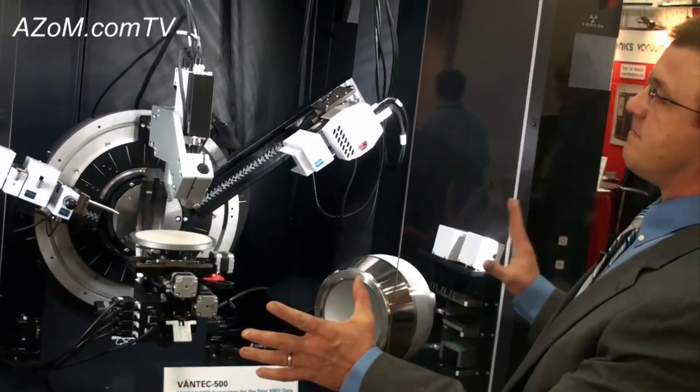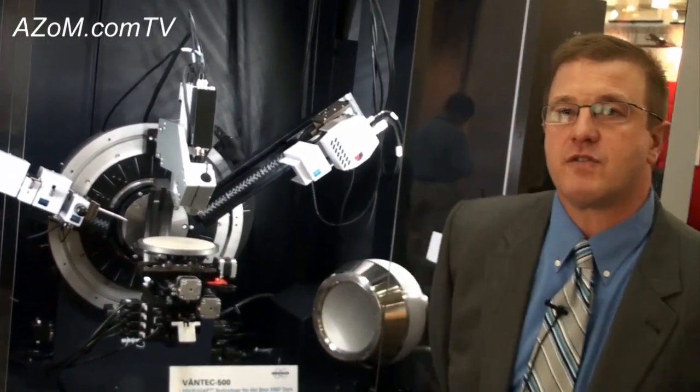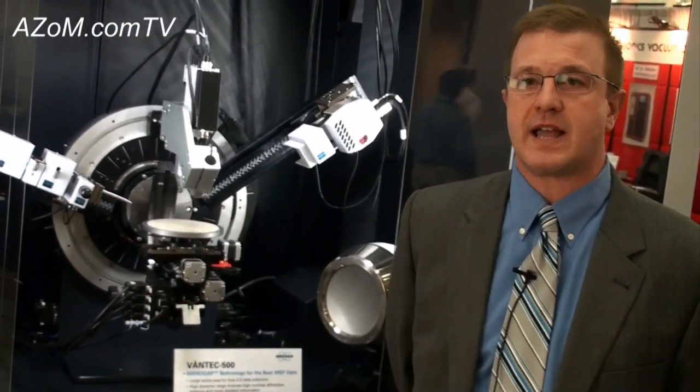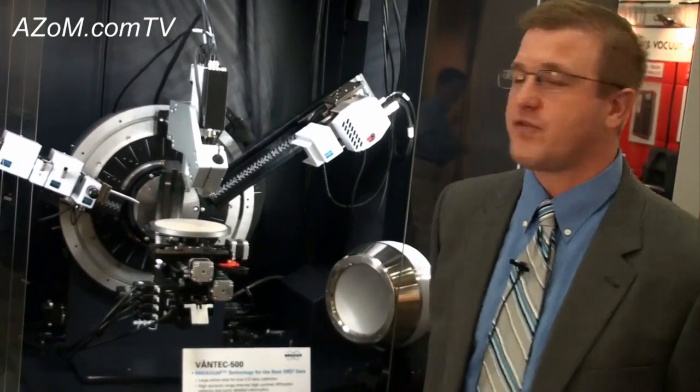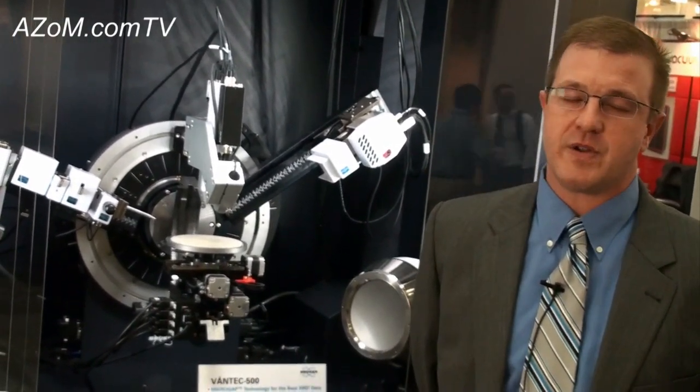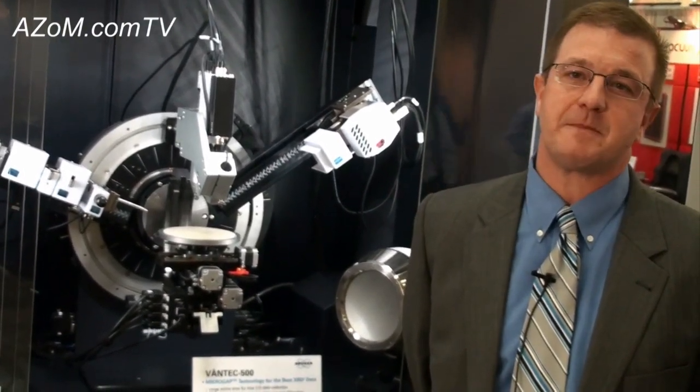And we put all of these nice components into our flagship D8 Discover. The D8 Discover is a well-known name within the industry and has been used in many universities and industrial accounts over the last 20 years. So we're very proud to have this new flagship design with our new components and new detectors and look very forward to showing the market what this system's capability is. Thank you.